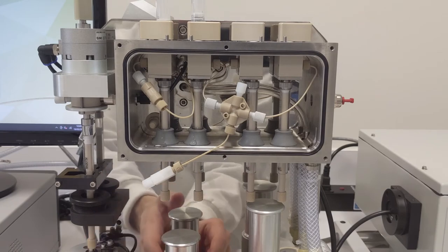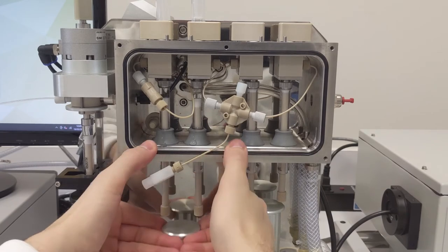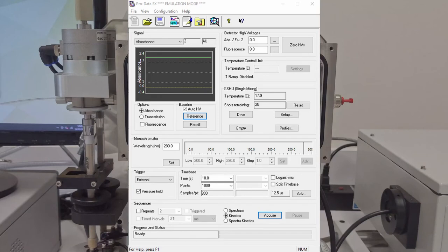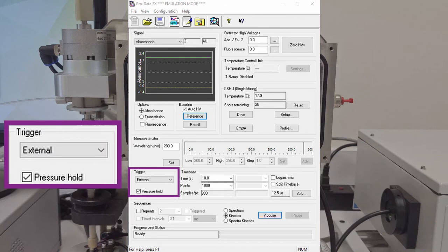After installing the ram and filling syringes with water, it's a good idea to test for leaks. Just set up the following experimental template, making sure the pressure hold checkbox is ticked, and press acquire.